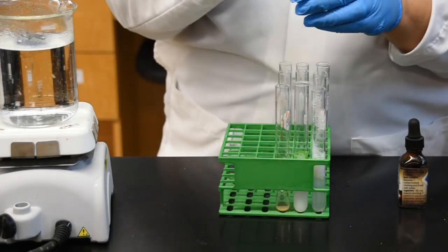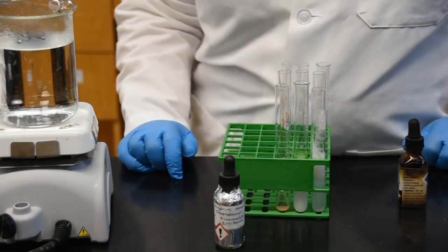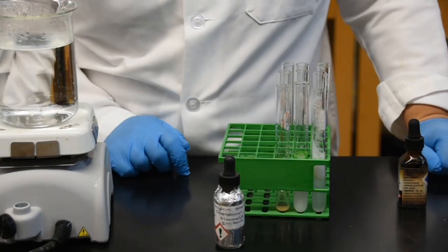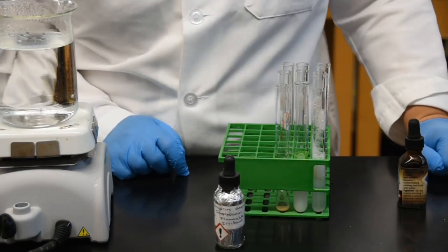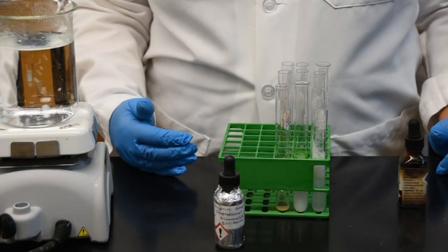Now, ninhydrin will be used to identify proteins. If you're looking at a sample that does contain protein, and we heat that sample in the presence of ninhydrin, then your sample will turn to a purple color. However, if the sample lacks protein, then the color will stay clear.